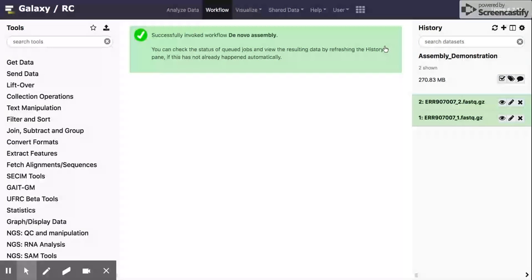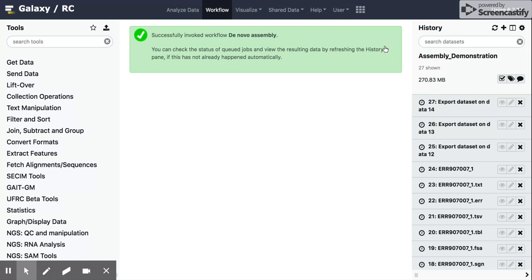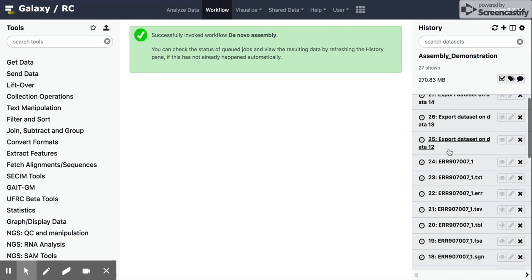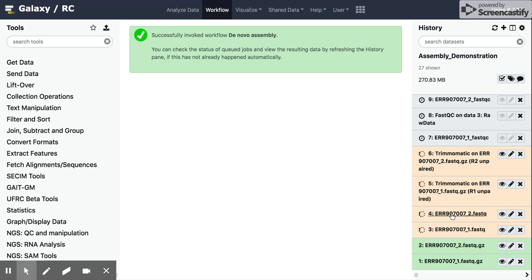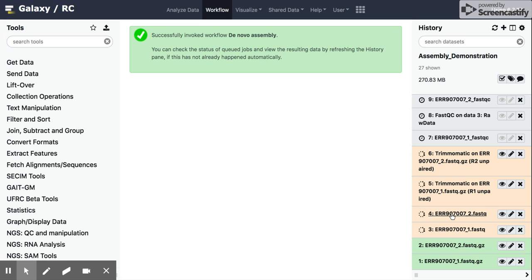And then you should see all of these steps load into that history. And as it starts working, we'll see these turn from gray to yellow, which means that they're running. So now we just saw the Trimmomatic start to run on the input reads. And so it's yellow. And then as those complete, they will turn green and it should start the next step. If they fail, then they will turn red.